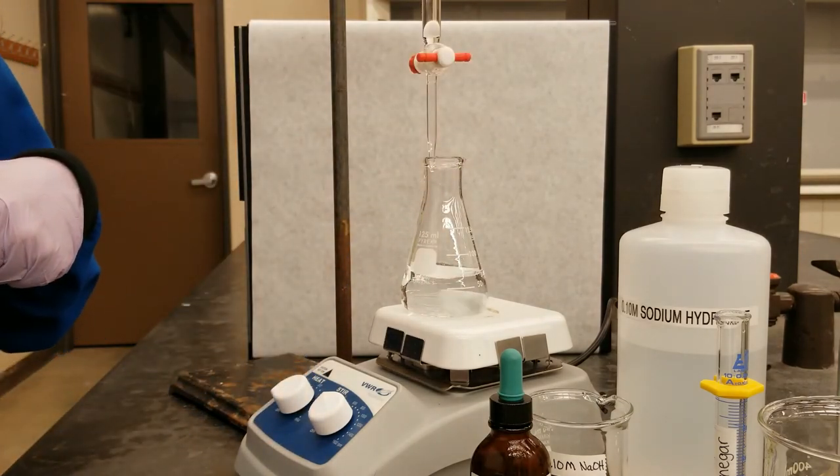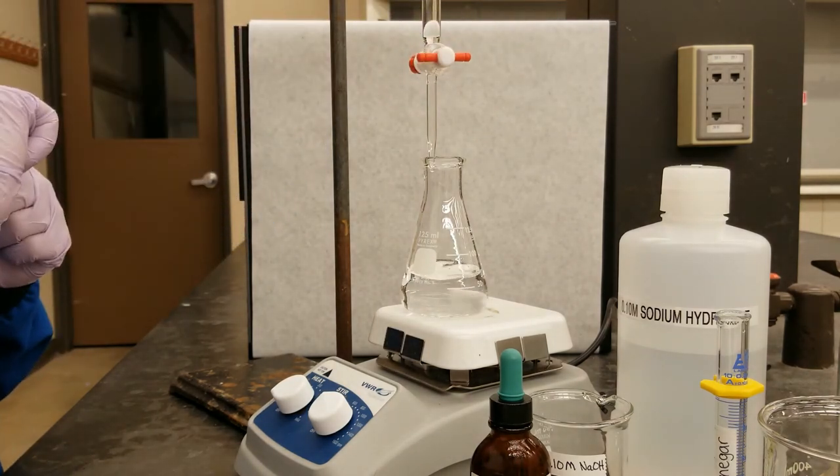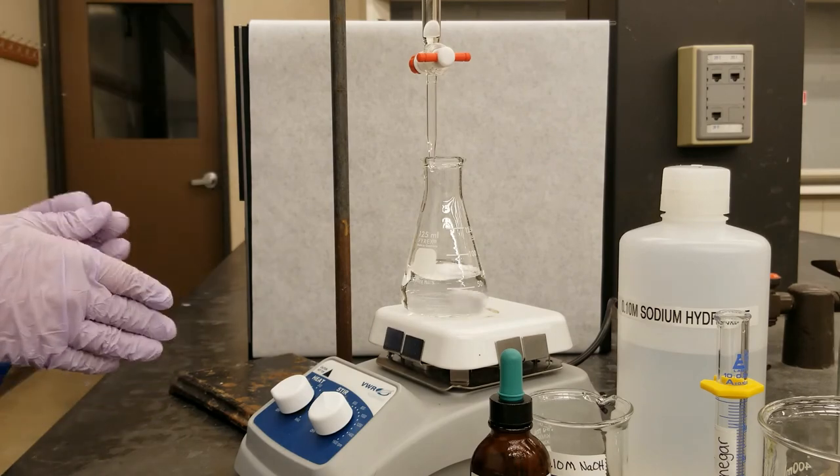And what I'll do right now is called a split drop, where I'll turn the stopcock really quickly to get one drop in rather than letting a lot of the solution fall through.